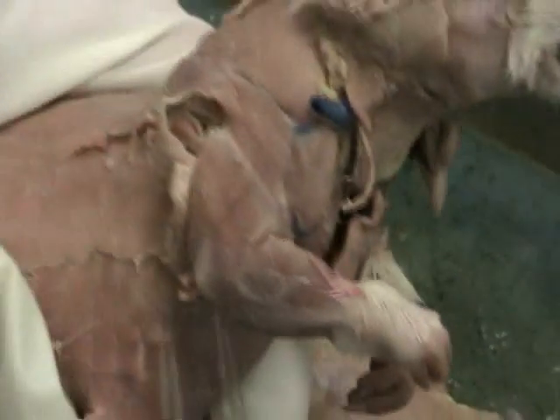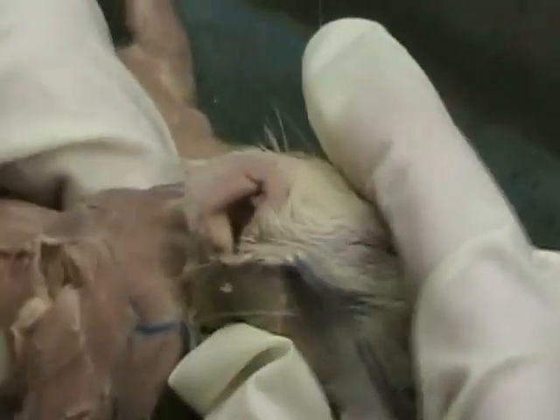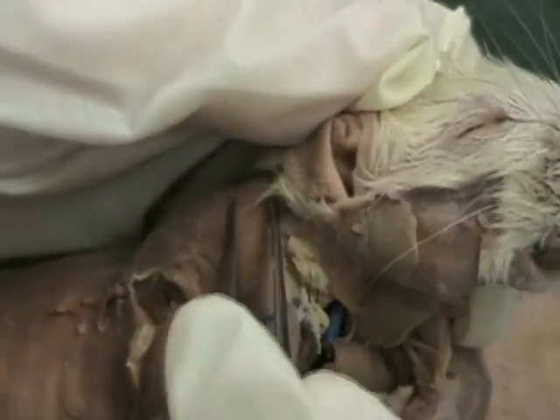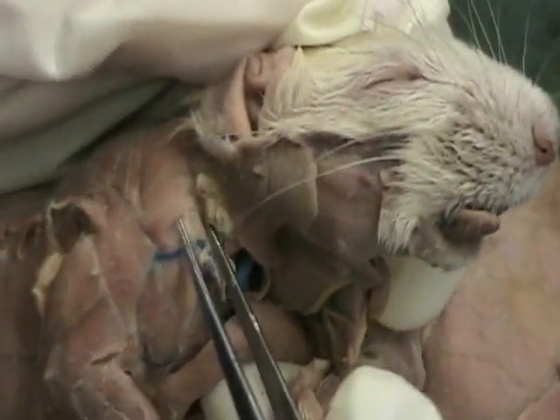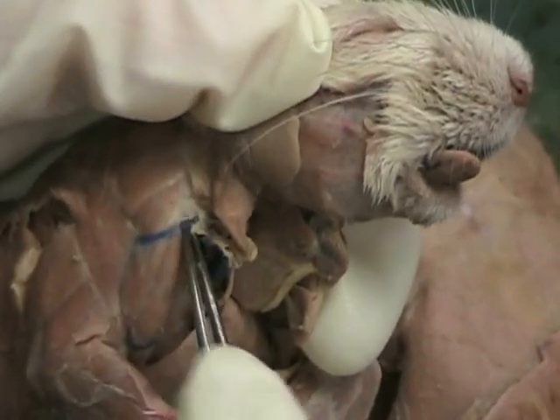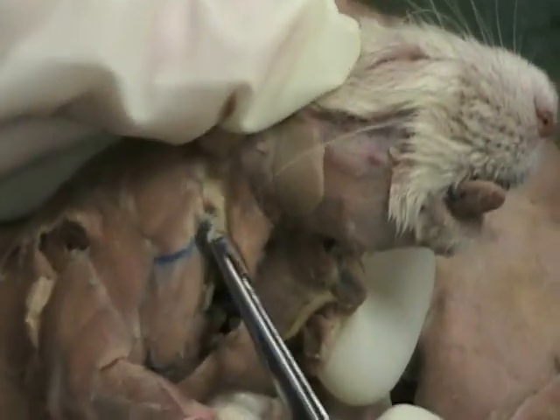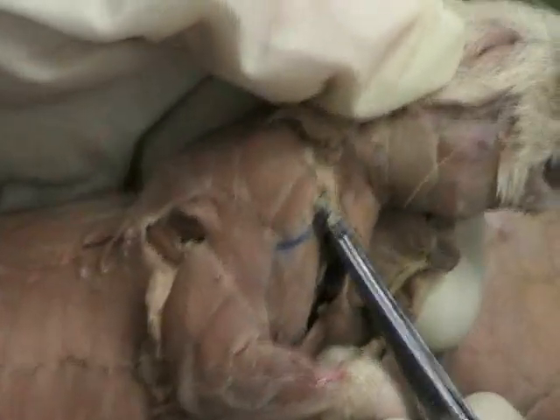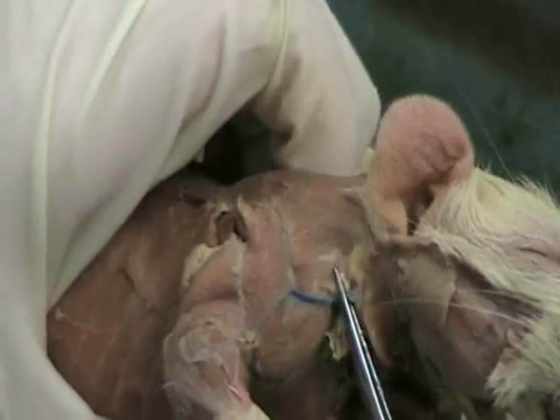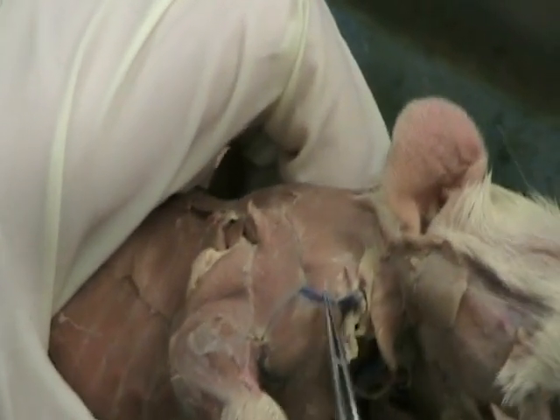Right. Okay. Then let's see. So here was the cervical trapezius going down. At the base of the cervical trapezius, you should find one going fairly perpendicular to it. And that is the one going across the shoulder. That is the omo transversaris, and you can see it right there. Omo transversaris is right here, going across the shoulder. Okay?